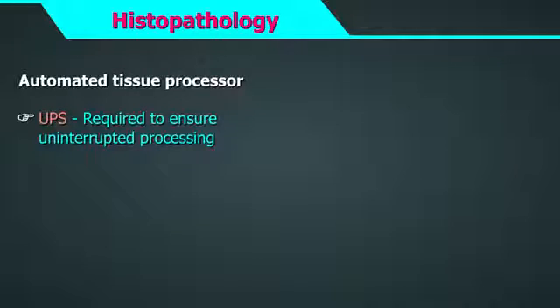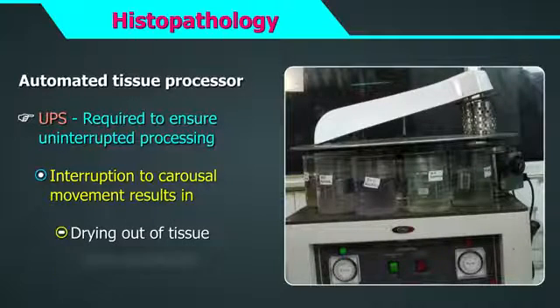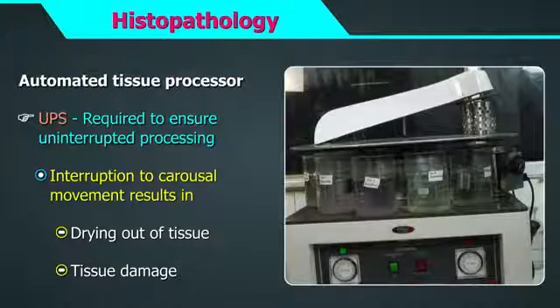Since the processor is run during night hours, contingencies for breakdown should be followed in the event of a UPS malfunction. Interruption to carousel movement can result in the basket hanging above, leading to drying out and tissue damage. Similarly, prolonged immersion in xylene, isopropyl alcohol, etc.